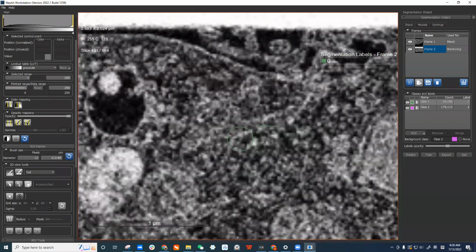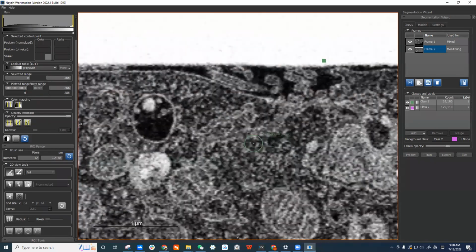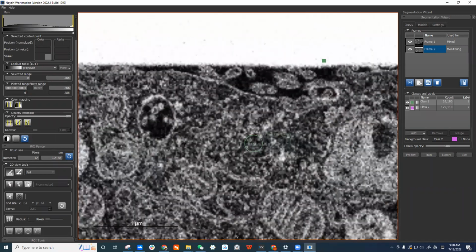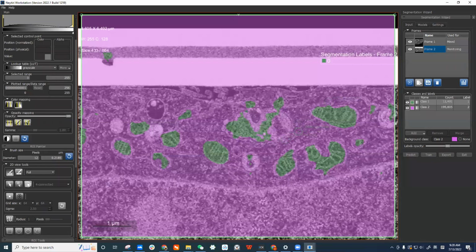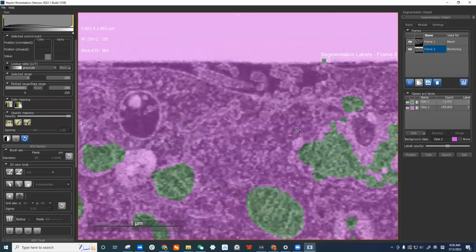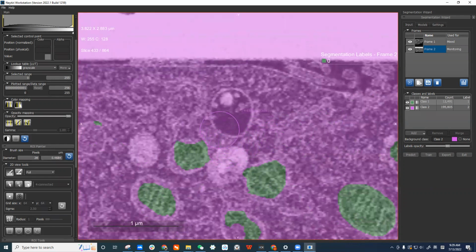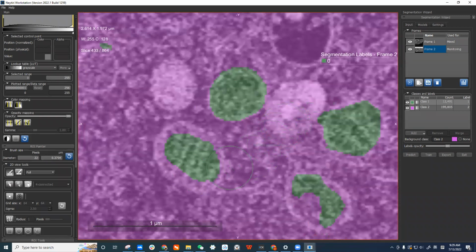You see the image quality is terrible. I don't know how the model could identify. Even for my eyes, it's not easy. I only see some of them when they are very obvious. Many of them are not very obvious, and I had difficulty telling if they are mitochondria or not.